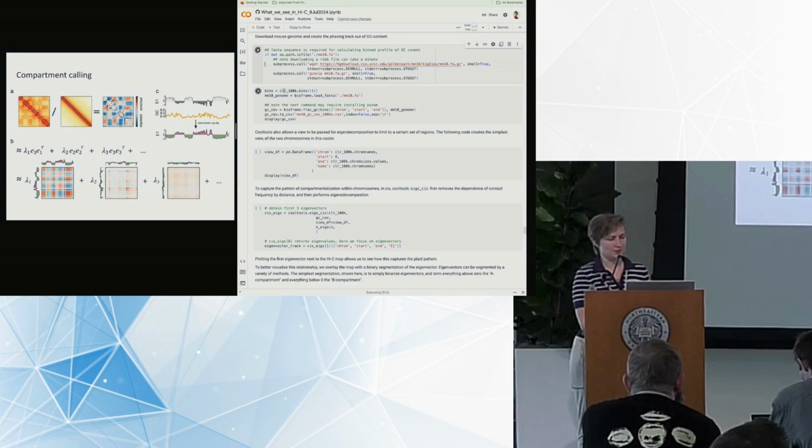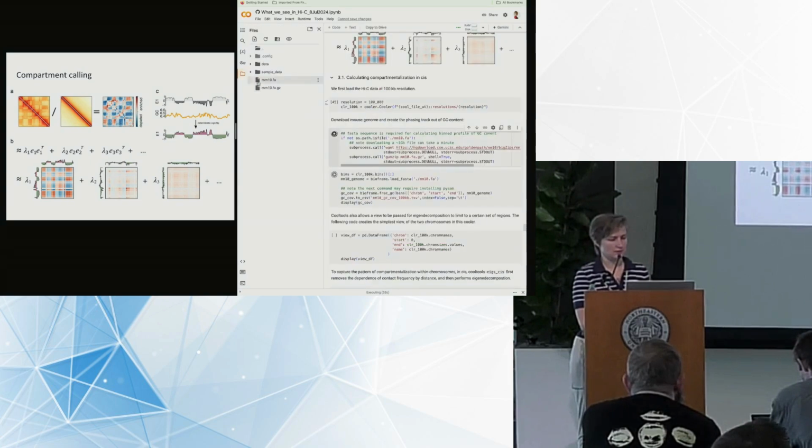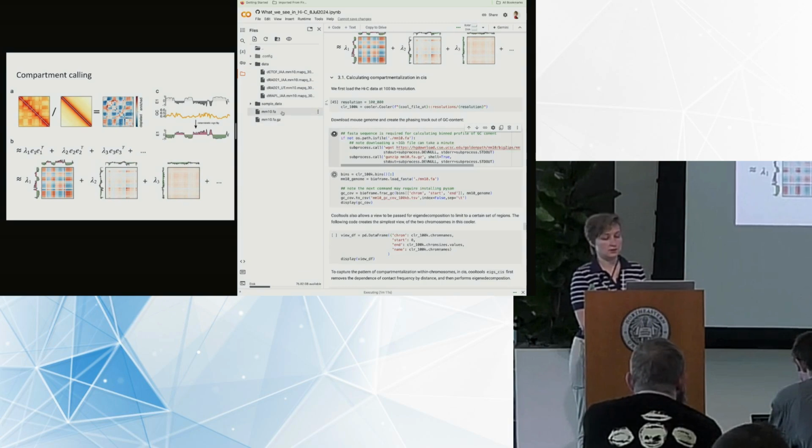If you are a little bit anxious like me, you can look at the folder structure that was created during the workshop. If you press on the folder on the left, you will be able to see what data sets we generated today. So we downloaded the sample data, and you can see 4 files here, and you can see the genome that is currently being downloaded and unpacked.